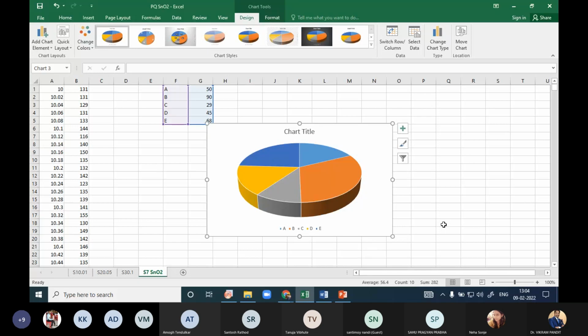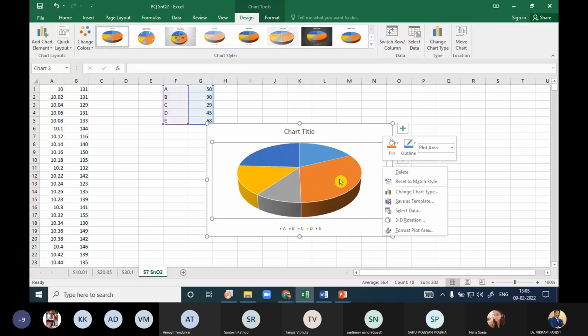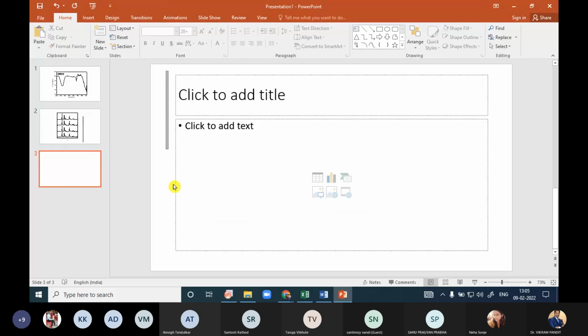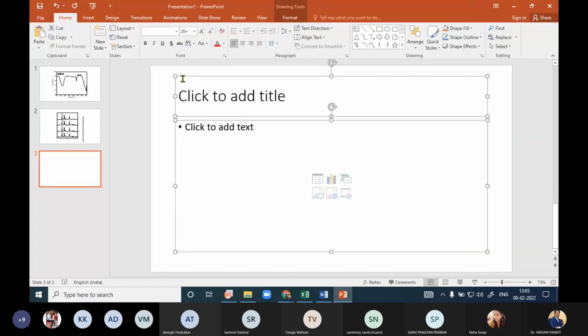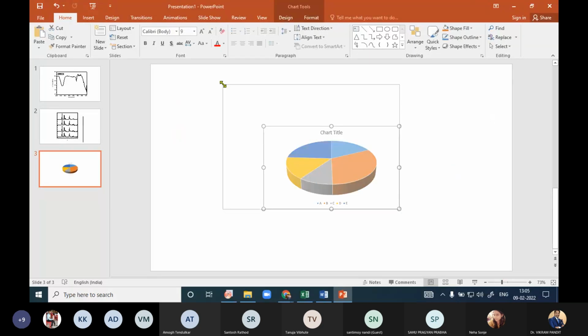See, now this type of presentation has never been given in so many papers, so many presentations, your own presentation. This type of data is not being shown. Here A, B, C, D, you can put whatever your data is, and you will get the percentages over here. You can just make a copy, Control C, for this particular presentation. And again, go to our PowerPoint presentation, select it and press Control V. Okay, such a very beautiful graph you are getting.